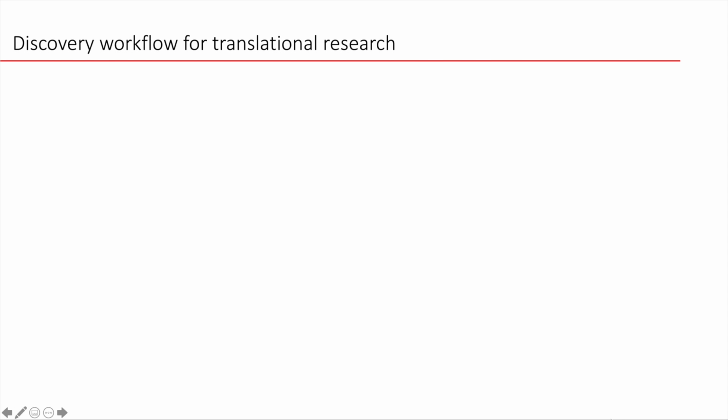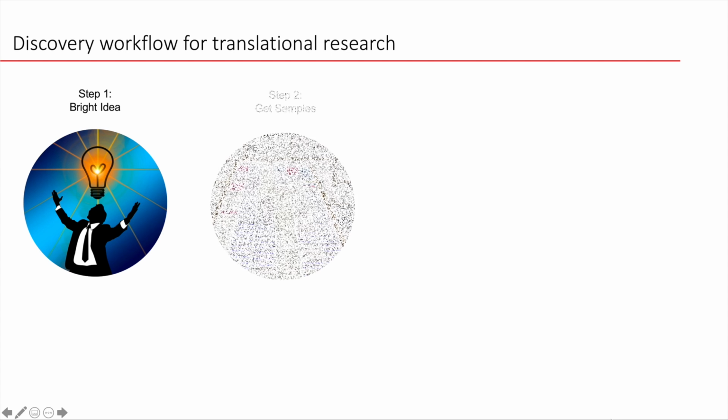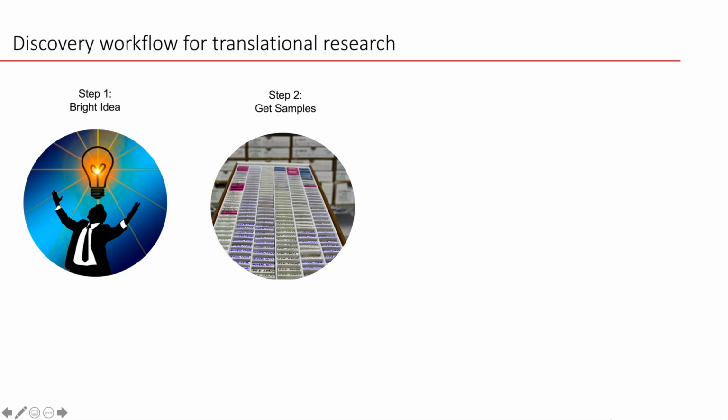And really to put this presentation in context, I'm going to tell you what our translational research workflows look like and where biobanking fits in. We usually start off with a bright idea or not so bright idea where we have a hypothesis about what question we're trying to answer. And then based on this, of course, we will contact our local biobank and try to get the appropriate specimens to answer this question.